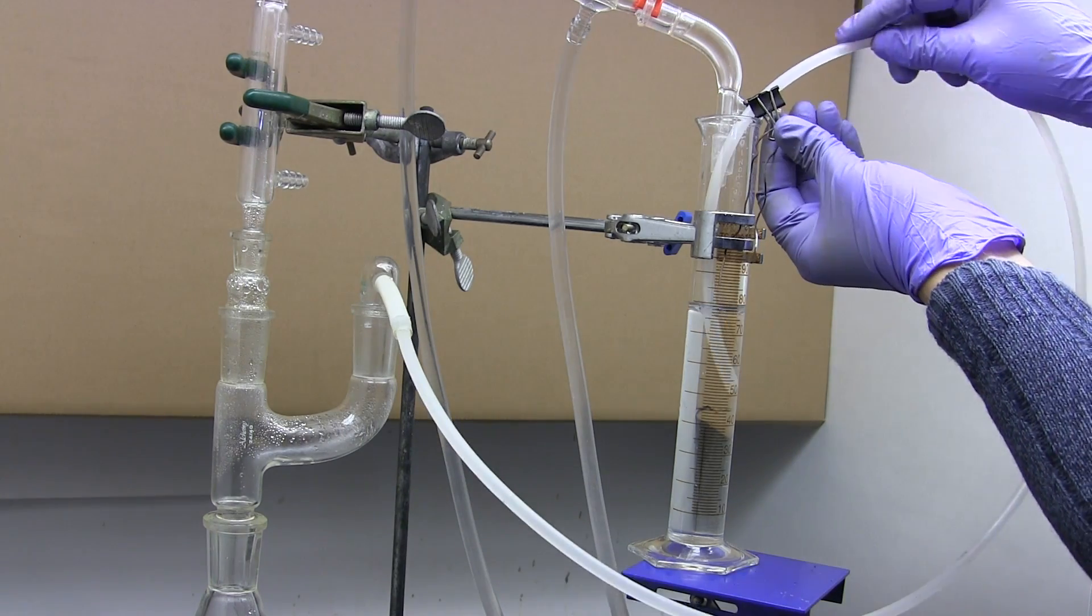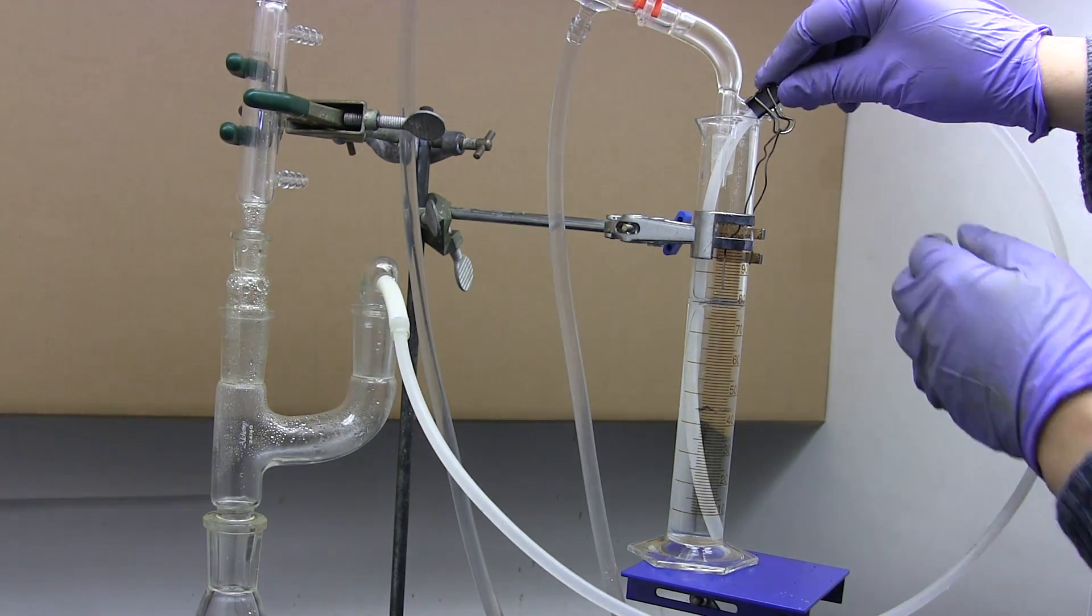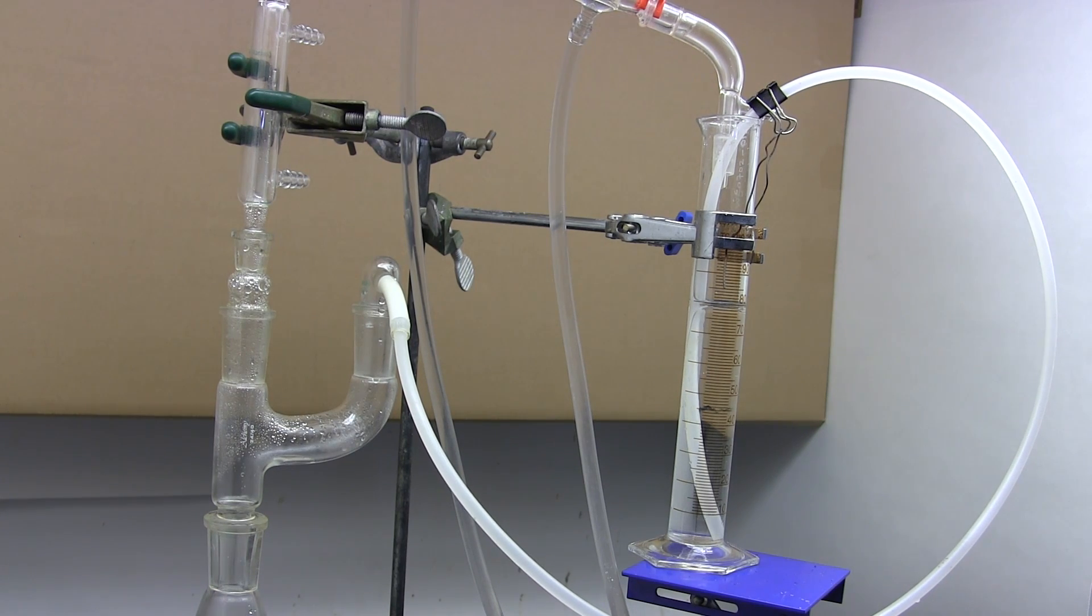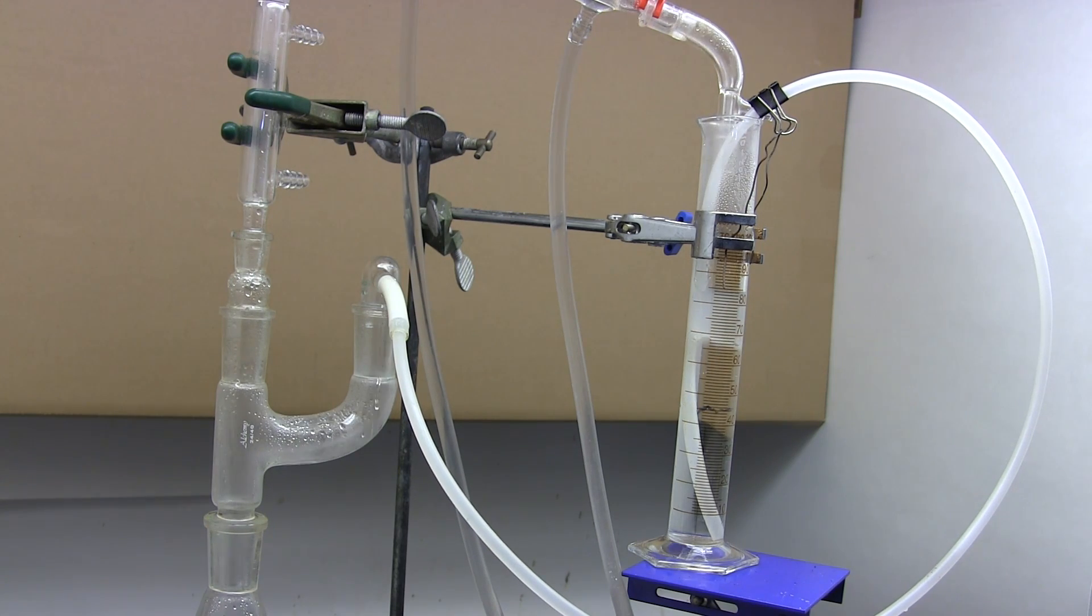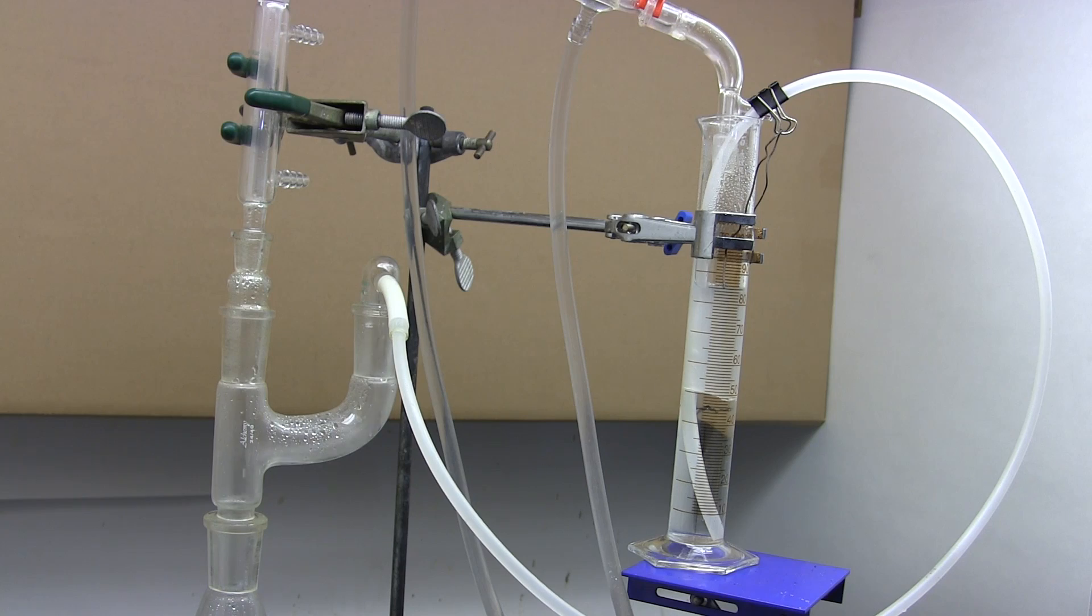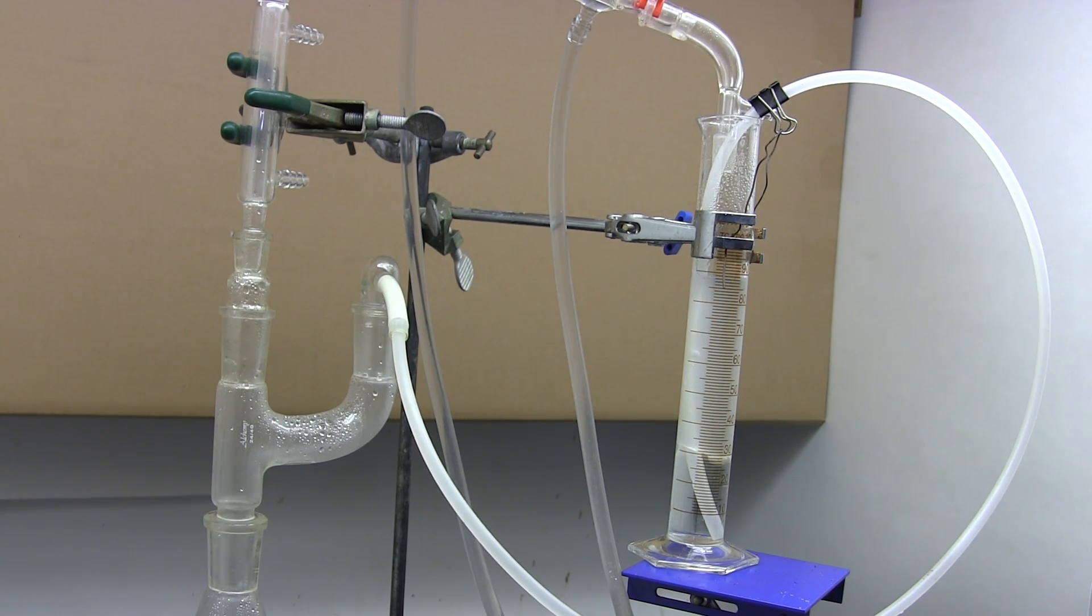Once everything is set up we just perform one simple change to convert this apparatus to heavy return mode. We push the siphon tube in the graduated cylinder all the way to the bottom. And that's it. Let me turn on the heating. Now when the distillate pours into the graduated cylinder the siphon tube sucks out the heavy layer and returns that. The lighter layer has nowhere to go and thus accumulates in the graduated cylinder. Heavy distillate will sink through the lighter layer and accumulate in the bottom where it can be siphoned out again.